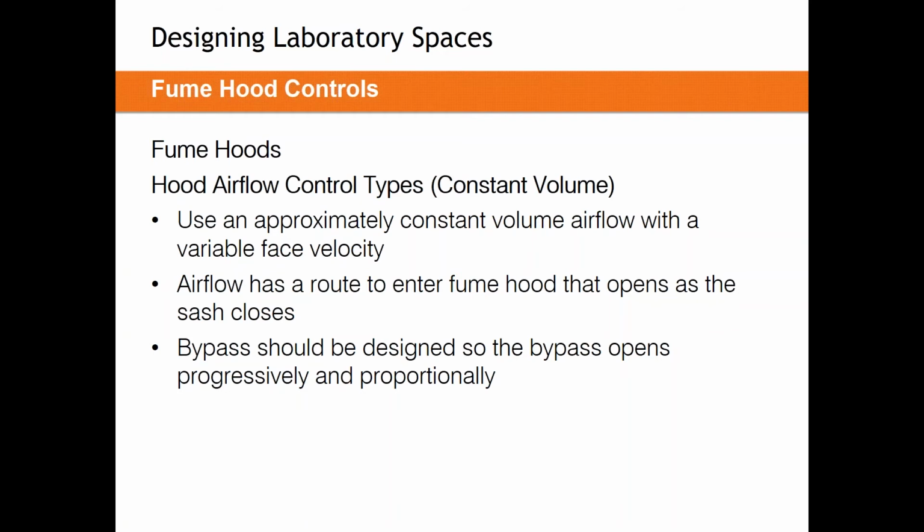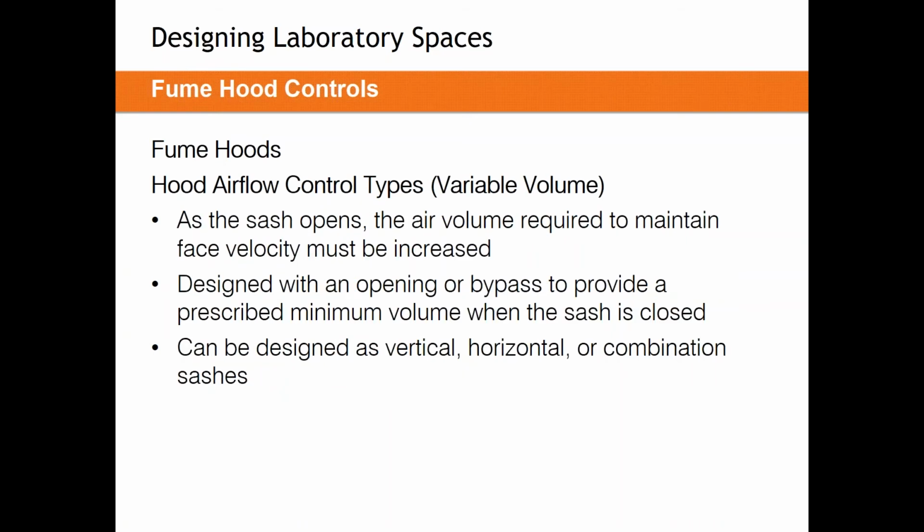I say that because they're a more simple device. The controls are less complex, which means they're less expensive and easier to set up and maintain long term. Maintenance of these systems and startup of these systems is absolutely something we have to consider when we think of first and ongoing costs. The other type of hood we can look at are variable volume fume hoods, which are basically the opposite of constant volume.